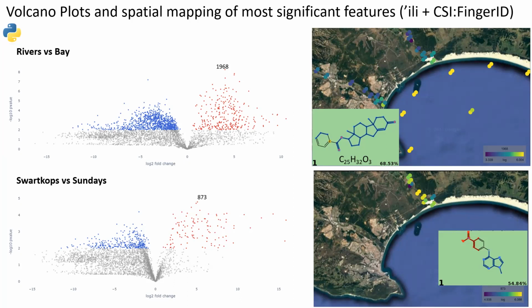Another comment, interesting stuff. Can you explain a bit more about the Quantum analytical tools? It looks very interesting. Yeah, I'm not too well versed on how exactly it works at this point, but it basically uses a machine learning model and then uses tables of ionization efficiency for different compounds. So Quantum is actually kind of half paid. It's not completely free. Let's put it this way.